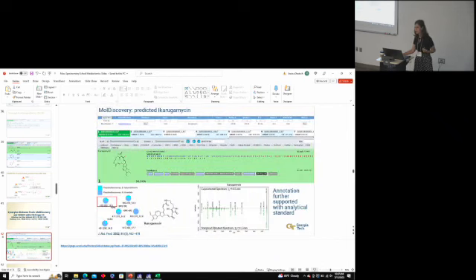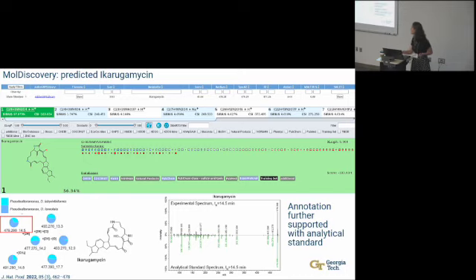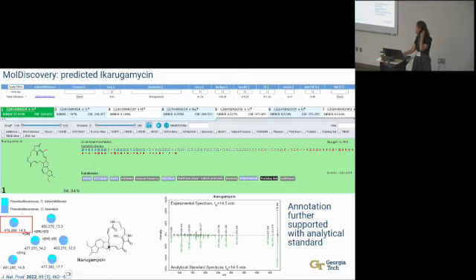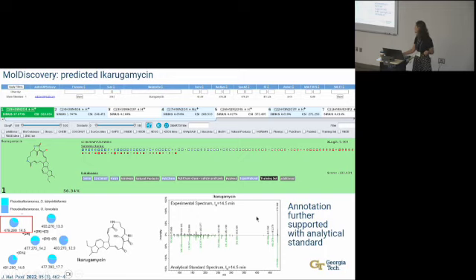There are instances in which tools agree — for this particular compound, both MolDiscovery and CSI:FingerID were predicting this would be ikarugamycin. Once we validated or became more comfortable with the predictions, we further supported this using an analytical standard. It's nice when your tools agree with each other.